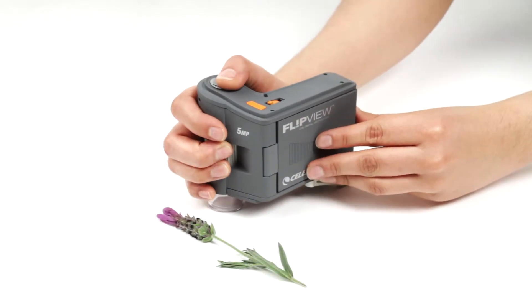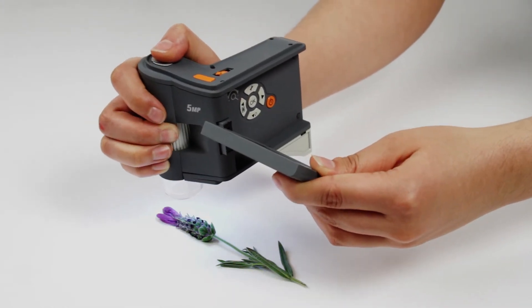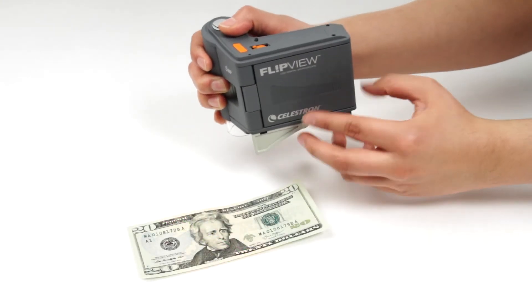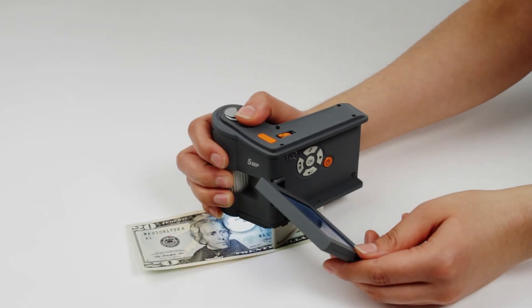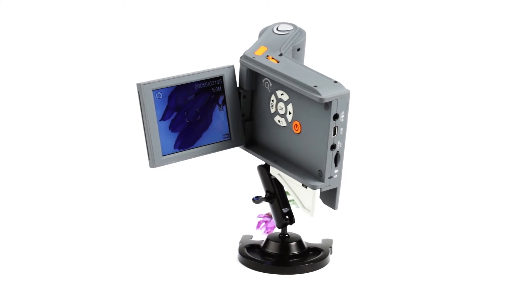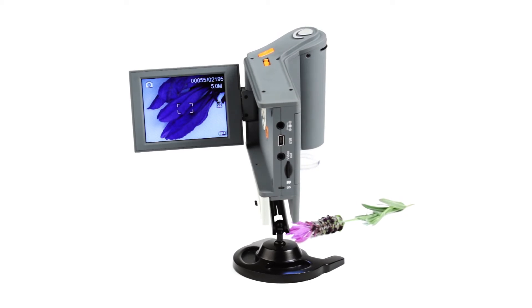Use FlipView three ways to get the best view of your specimen. Handheld mode provides maximum flexibility and versatility. The flip-out kickstand helps FlipView rest on any level surface, ideal for observing flat objects such as currency notes or paper. Or attach FlipView to the articulating metal stand to keep it steady and positioned over larger 3D subjects.